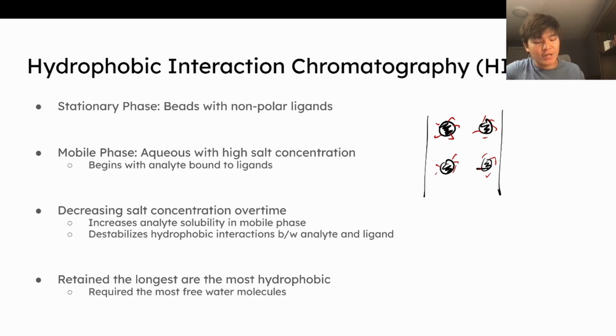Our analytes are typically proteins. Imagine we have a protein, and this protein is going to have hydrophobic and hydrophilic sections, some more than others, some less than others. Let's imagine the black is hydrophilic and the yellow is hydrophobic. I don't know if you can see that, but yes. These hydrophobic regions are going to interact with this ligand. Imagine we have our protein with a bunch of hydrophobic stuff on there, and the hydrophilic stuff. There's me chilling there.